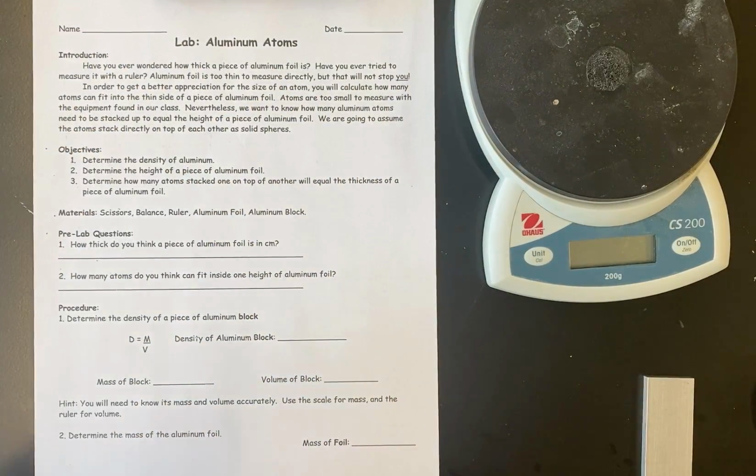The other way to do it would be to stack up maybe 100 sheets and then measure that and then divide by 100, but you don't have 100 sheets, so you're going to have to do it this way. So we're going to use chemistry to figure this out. So we have some pre-lab questions.